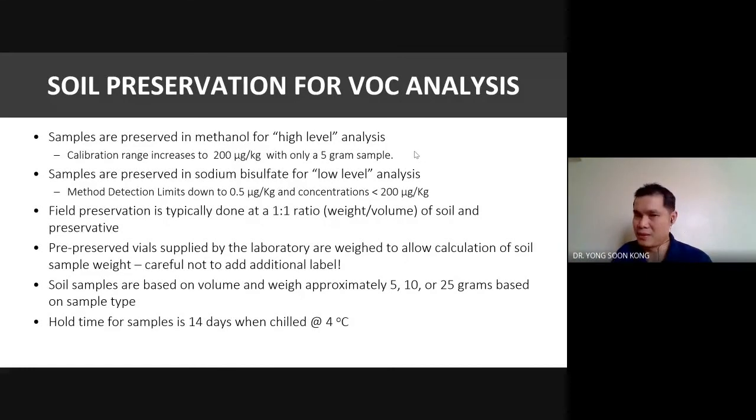And then does that represent your sample? Maybe not. These are like the cross-contamination that might affect the result. Which is why usually for detection of VOC, people will avoid using the self-prepared methods. This vial usually is bought.